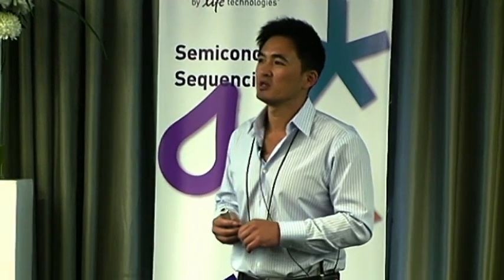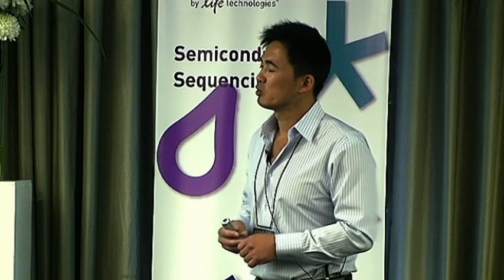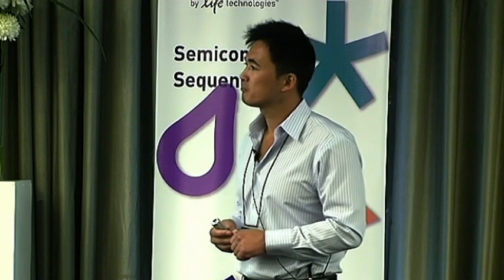The funny thing is, digital PCR was first described in proceedings in 1990. The first paper describing digital PCR was back then. No one really adopted it, and no one thought it was something that was really usable. It was, okay, interesting paper, great, but it's not something we can actually use and apply in our lab and in our research.